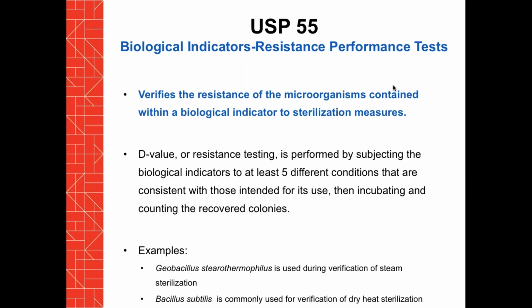sterilization. The population of the spores within the biological indicators would also be consistent with the level of sterility assurance that is desired for the sterilization process. Spore-forming bacteria are used for this application because they are the most resistant form of bacteria to a sterilization process, due to their ability to protect themselves by forming a spore that aids in their survival in unfavorable conditions.